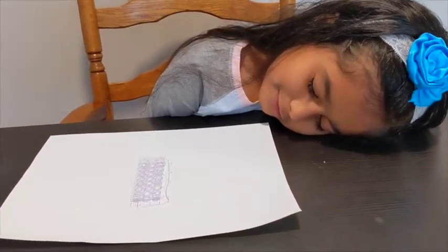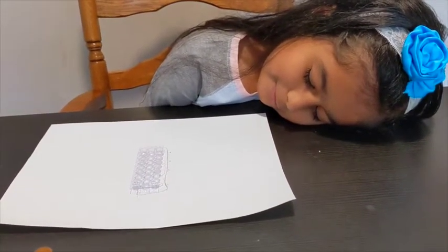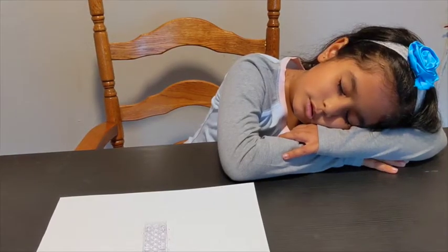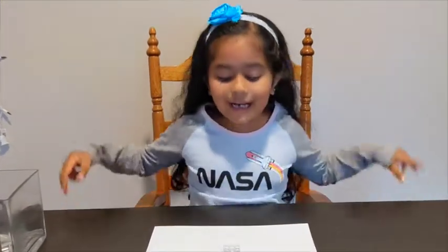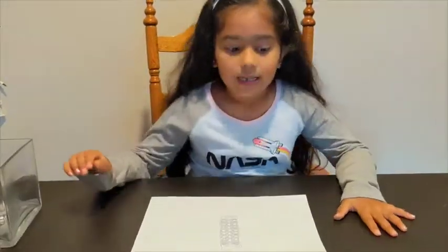I should take a nap. A few moments later. Time's up! Now this is the final step. I'm going to add the substrate into all my wells.